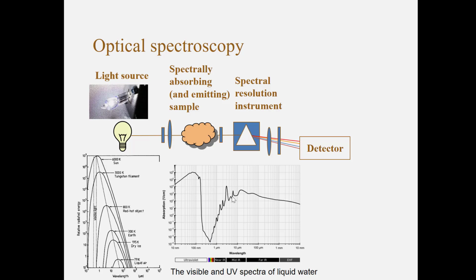And here we can see that we have some spectral features which we might use. These spectral features, for example, we could use to look at the fingerprint of this material. So if we see something with exactly this fingerprint, we know that we have liquid water.